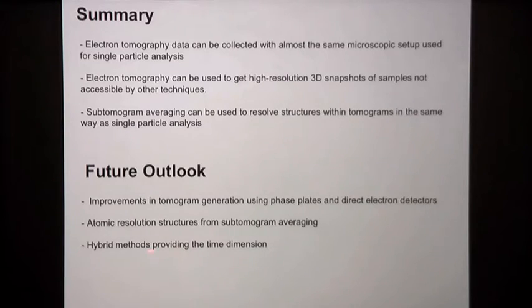And as I presented in this case study, I think hybrid methods will provide the time dimension and allow us to get biological insight far beyond that can be provided by electron tomography. Thank you.